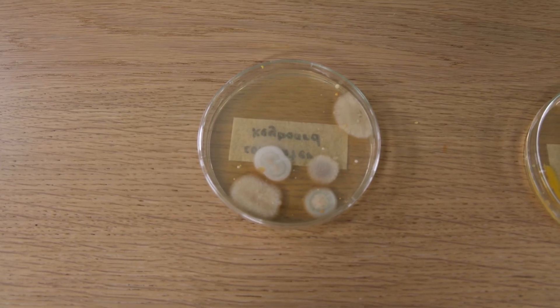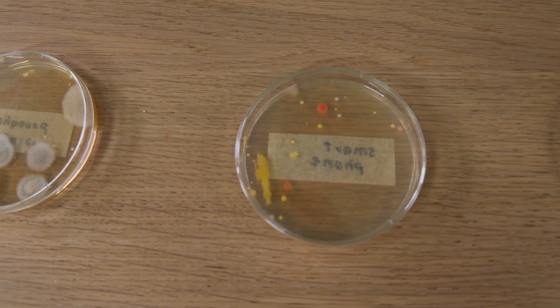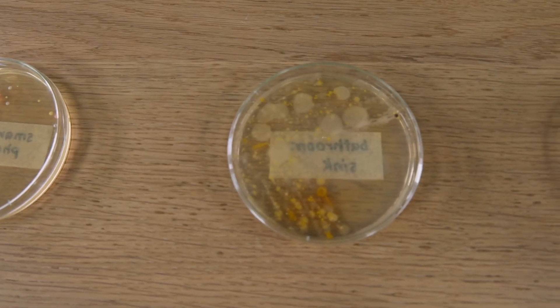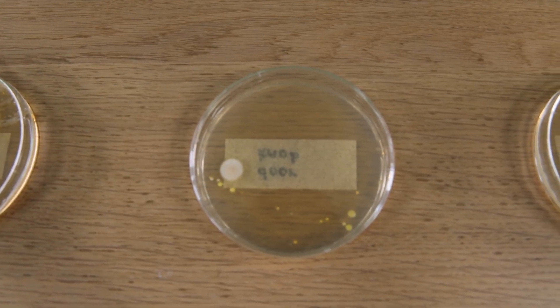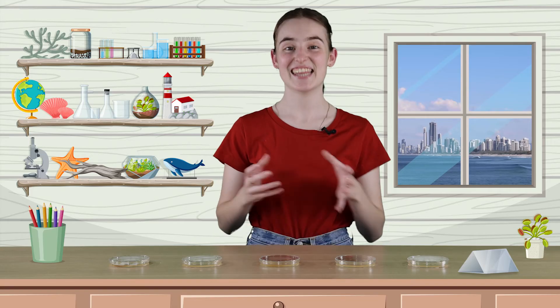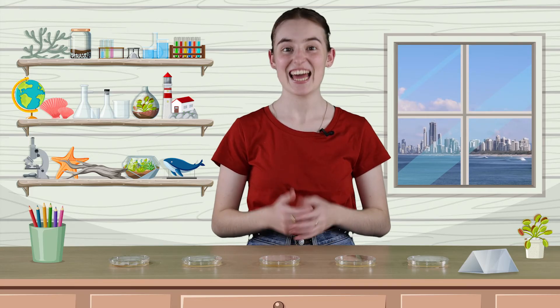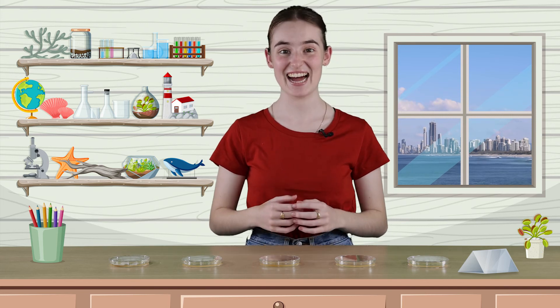Some types of bacteria can be harmful to our health, so keep the lids of the petri dishes on while making your observations. When you're all done, seal them in a bag and place them in the trash. That was really good fun. Thanks for stopping by and we'll see you again soon in the Lighthouse Lab.